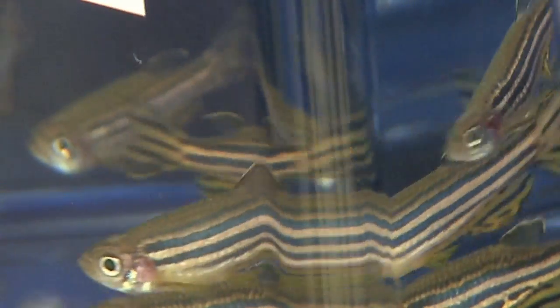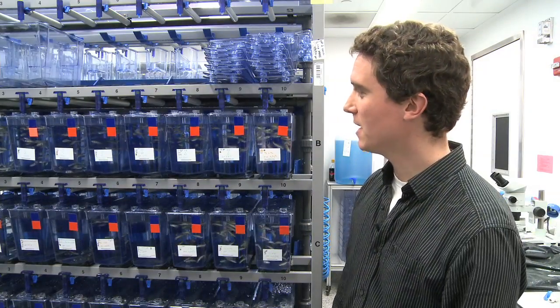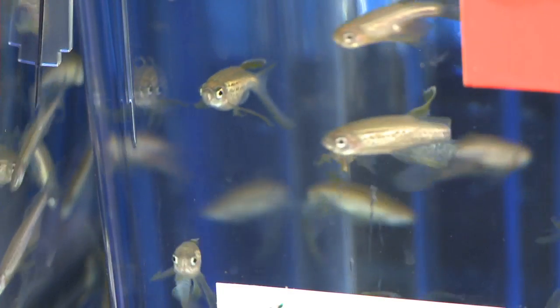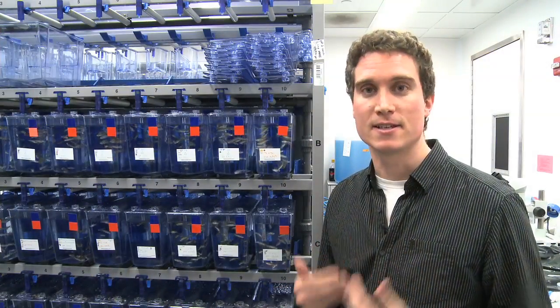In our study, we used zebrafish as a model system. You can see those here in the background. Zebrafish are vertebrates, and the hope is by using such a model system, we can gain insights from our whole brain functional imaging study that may potentially lead to insights about brain function as it applies to us as humans.